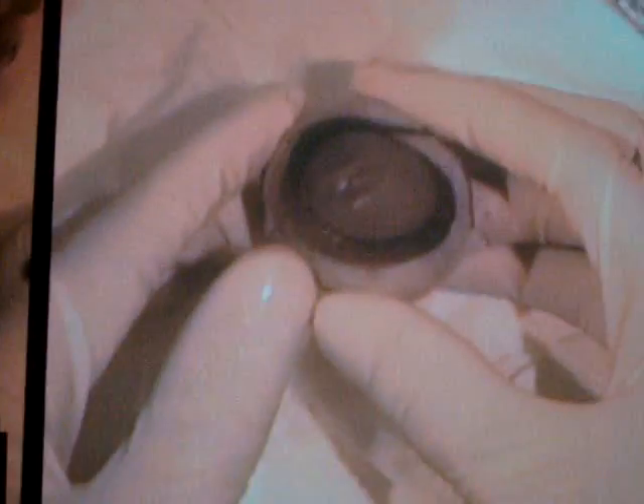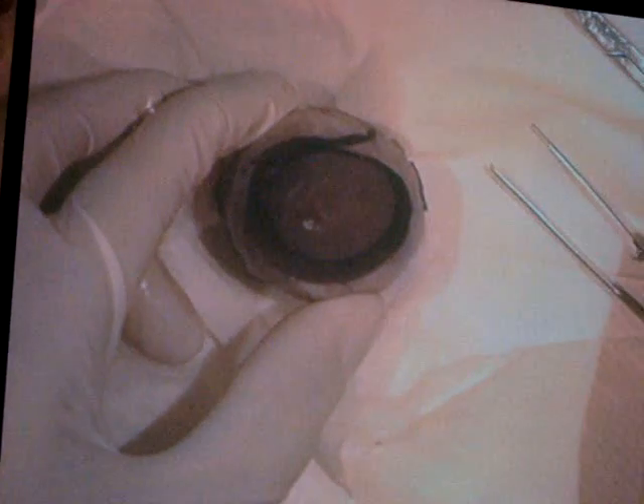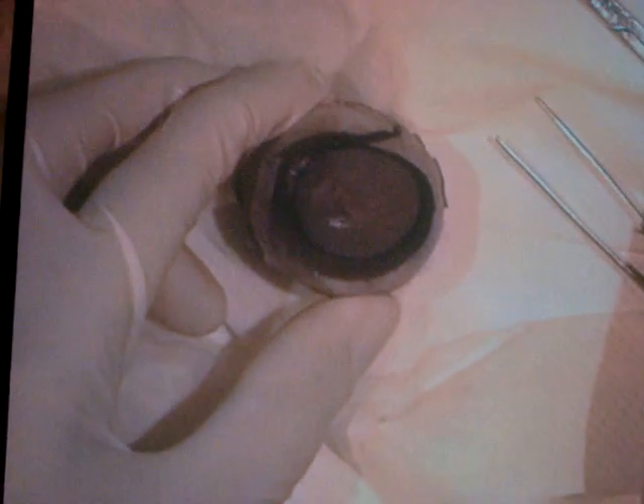This is the actual eye itself. Remember, a human eye is a little bit smaller than this — a cow's eye is about the size of a golf ball, while a human eye is about the size of a ping pong ball. There's a liquid in the eye called the aqueous humor, and a jelly inside the eye called the vitreous humor.